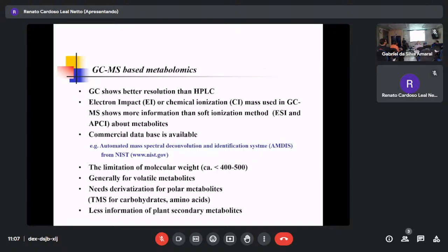It uses a needle for ionization, like an ESI or APCI basis. But CI means we have another medium gas. I don't want to directly ionize the compound. Instead, I have methane or ammonia. I ionize this gas, and then the ionized gas ionizes the compound indirectly. In fact, we expect the energy to be low, so it would probably detect the molecular ion.